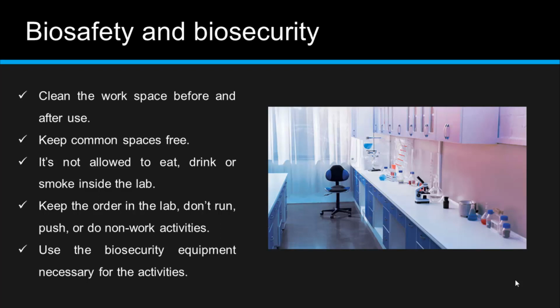Clean the workspace before and after use. Keep common spaces free, and it's not allowed to eat, drink or smoke inside the lab, for obvious reasons. Also, we have to keep the order in the lab, don't run, push or do non-work activities. The laboratory is a workplace.